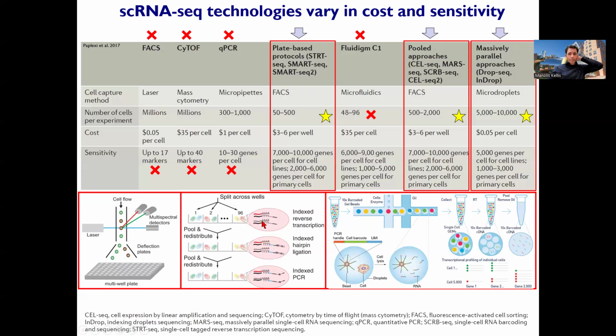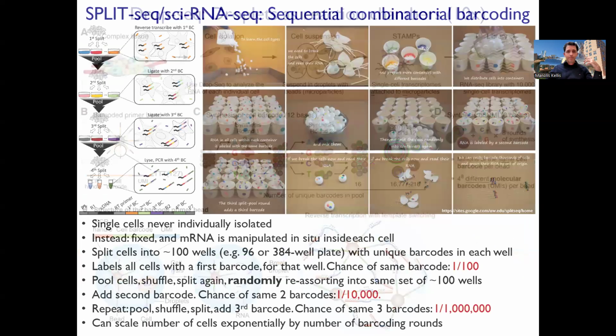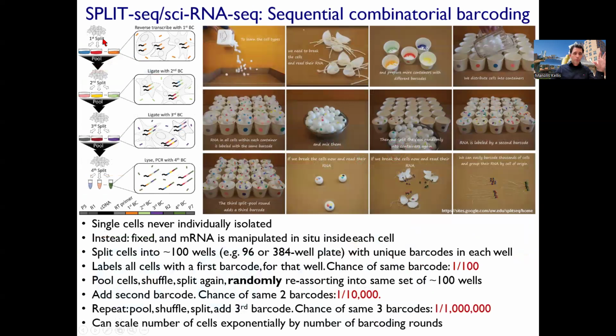And then in the middle, you have this very cool technology that I will explain in the next slide, which is that there's another way to do this. You have, let's say, a million cells. In the first round, you split them into 100 wells. All of the cells in the blue well, I just color blue, with a barcode that's, I don't know, 6 nucleotides, for example, or however many nucleotides I need to distinguish, let's say, 100 of them. Whatever log4 of 100 is. You then blend all of your cells together, but now they've been colored blue or red or orange or green or yellow, etc. Everybody with me here?